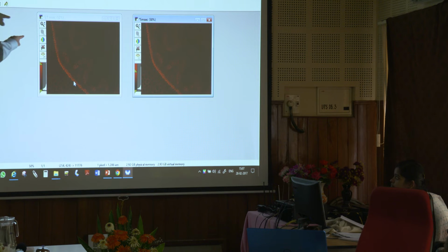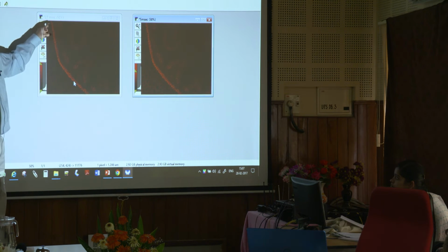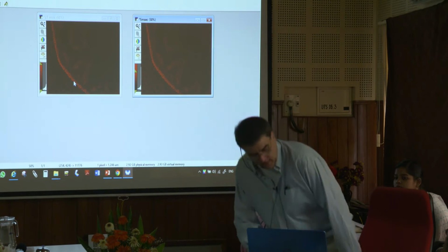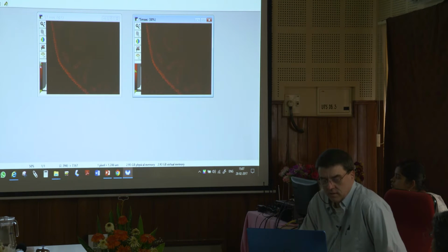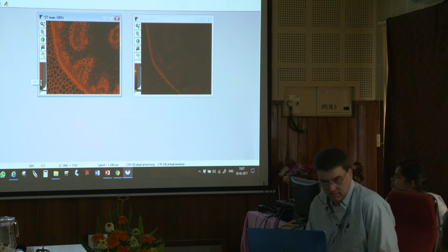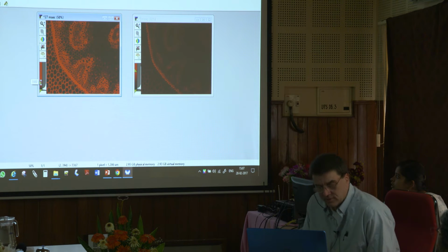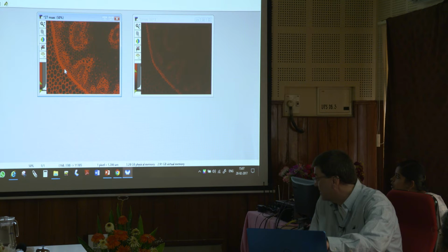Remember the pixels. Remember I said the most important thing is this. The data on this slide, on this image, is these pixels. Okay? That's the data. If I take this image and I make it look like this, you would say, that is horrible. That is just a lousy picture you took. It's all saturated, it looks horrible, right? It's the same picture. If we go to that exact same pixel, it's still 11,000 whatever.